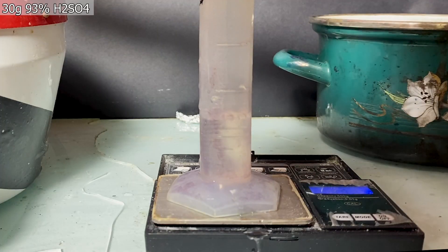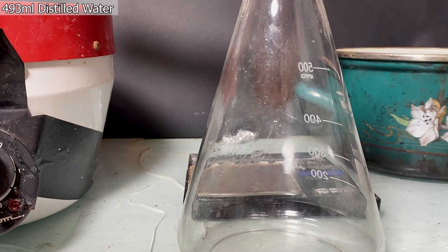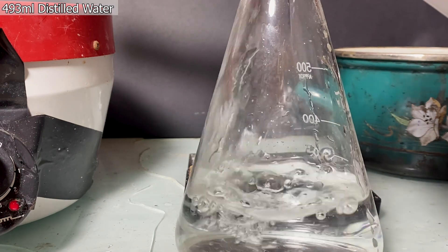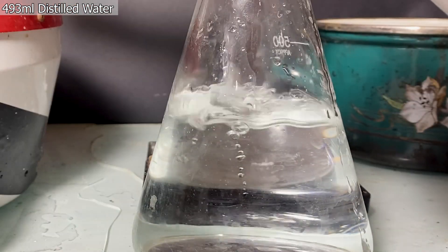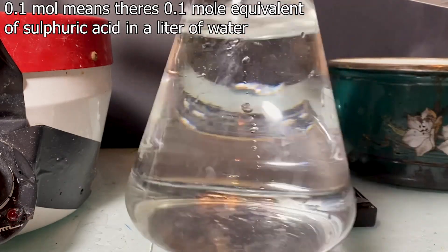To start, I measured out around 30 grams of 93% concentrated sulfuric acid solution, after which I measured out around 493 ml of distilled water. Here I'm basically making a 0.1 molar sulfuric acid solution.